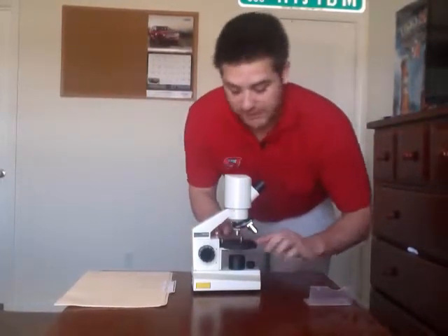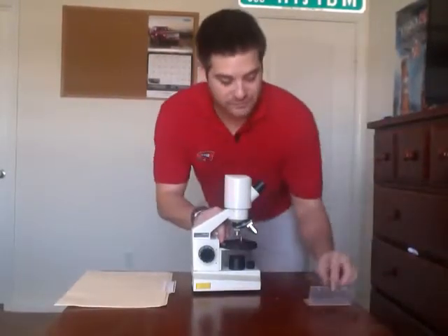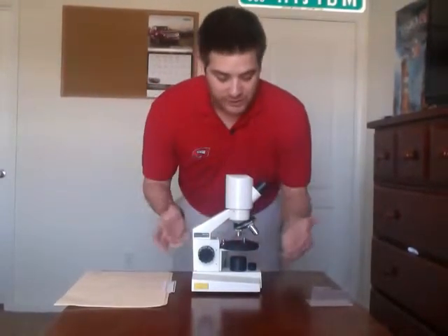And this round black piece with the two clamps, these clamps right here, is what holds your slide together. And the black piece underneath of it is called the platform. This is where your slide goes, whatever you're wanting to see up close. And underneath this bottom piece is the light. This will allow you to see once you place your slide on here. If you don't have the light on, then you won't be able to see anything. Okay, and that's just a basic rundown of a basic microscope you would be using.